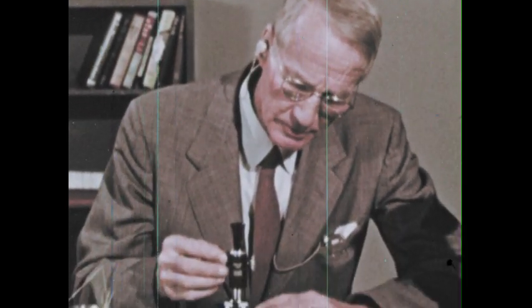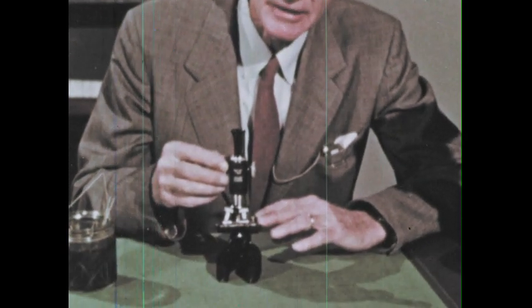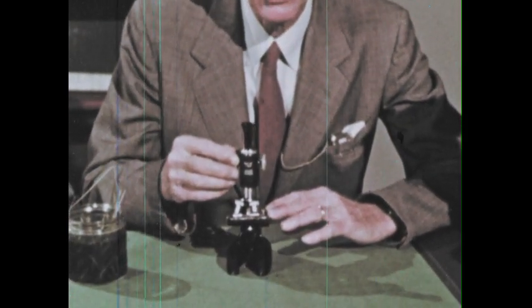I've been looking through this microscope. It's very like the ones you are using, and an admirable little instrument it is. It magnifies up to two or three hundred times. But I find there are some difficulties with it. As you work with it, it's not too steady and it tends to jiggle around somewhat. It's very difficult to get the light just perfect so you see the most out of the material that you are studying.